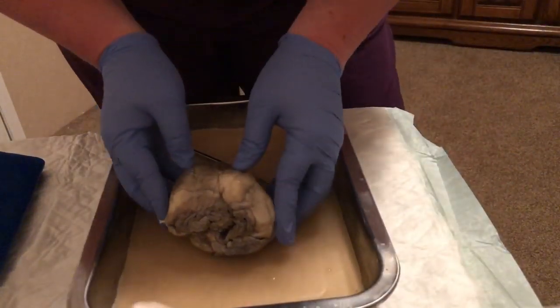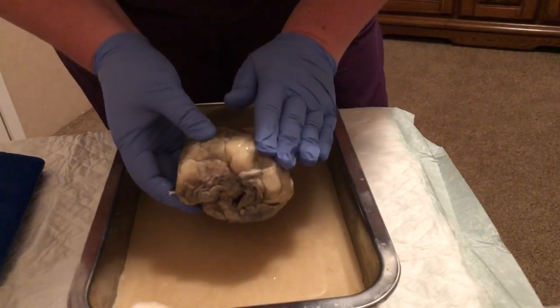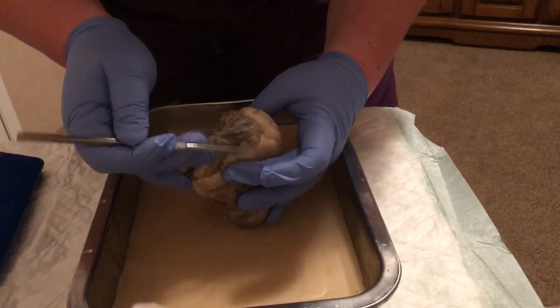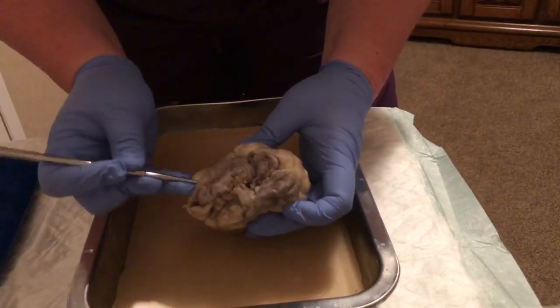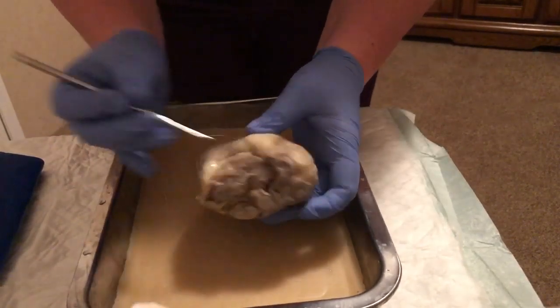Okay, so here we have the sheep heart. We've done a dissection on it. We have the right side of the heart and the left side of the heart. On the top of the heart, we have the right auricle here. On the left side of the heart, we have the left auricle here, this big gray flap.